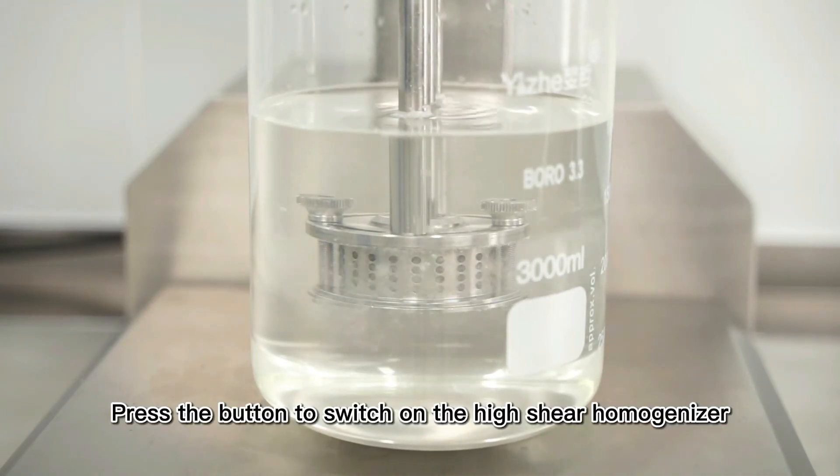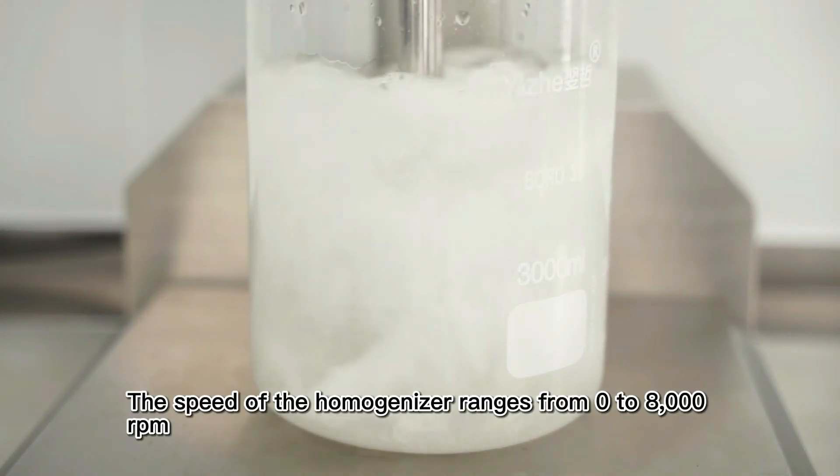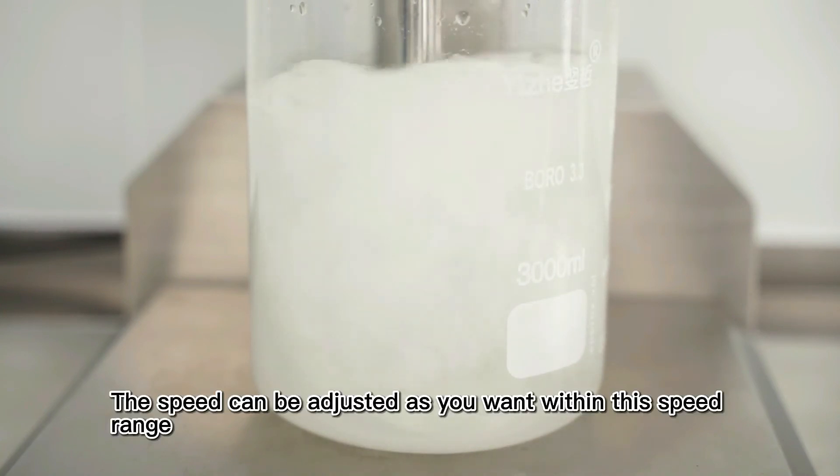Press the button to switch on the high-shear homogenizer. The speed of the homogenizer ranges from 0 to 8,000 RPM and can be adjusted as needed within this range.